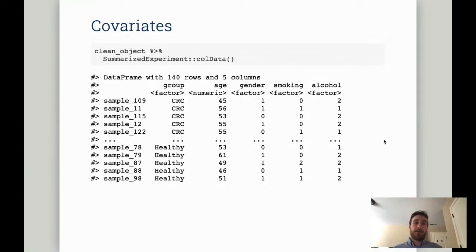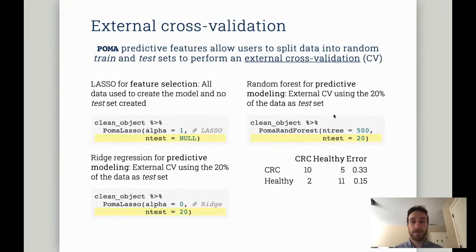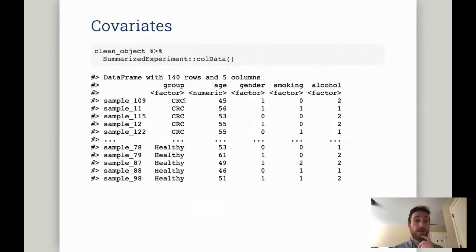Again, this is just a reminder. These are our count data, our target file, a subset. So we have only two groups here. This variable here, these are our samples, and we are working here so far. For example, in these models, our outcome is this group variable, these cancer and healthy groups.